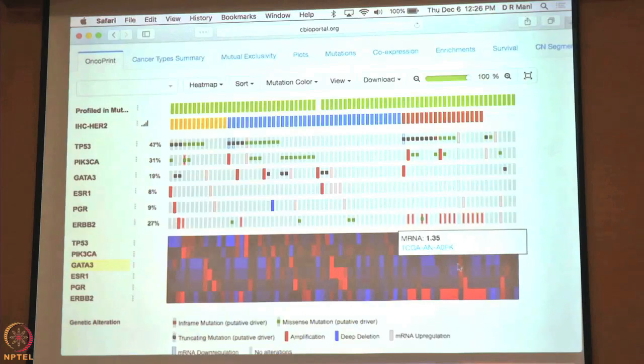The percentage of all those mutations is different, I mean, it's the same, what you have, okay? Yeah. But if you see the 27%, the map is different from what you have achieved. No. If you see the 27, no? The last... Yeah, you have 27, right? Yeah, but if you see it here... Oh, it's because I sorted. Aha, sorted. So if you go to the three dots with IHC, go here, yeah. Click on the three dots next to it, and you can sort A to Z.